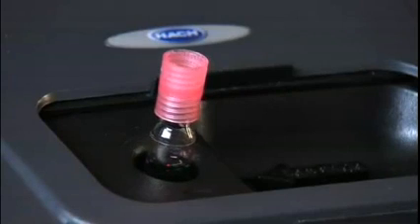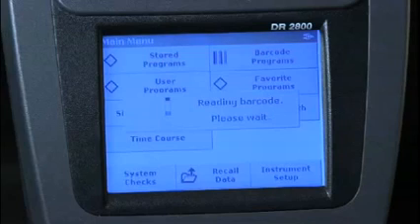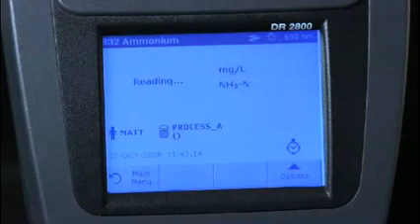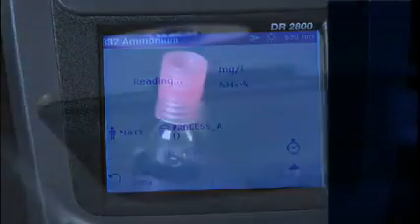With the first spin of the vial, the instrument scans the barcode and identifies the correct parameter. The appropriate method and wavelength are automatically selected, saving you time and reducing potential errors.